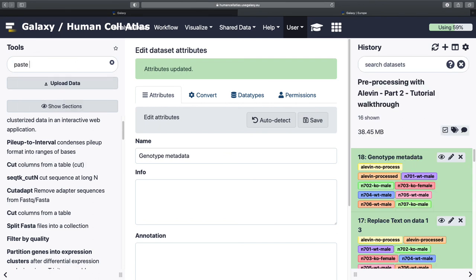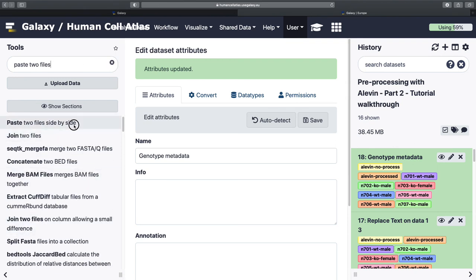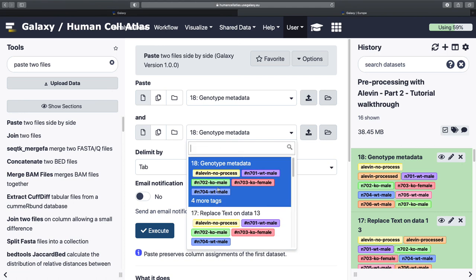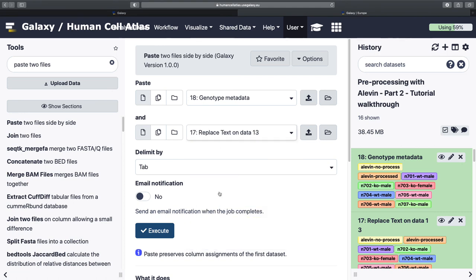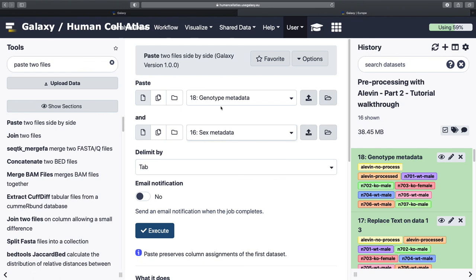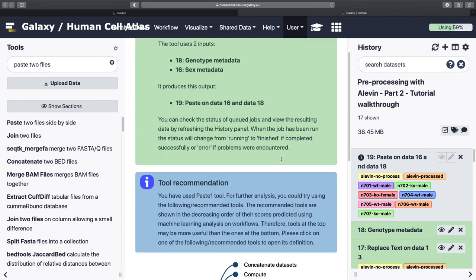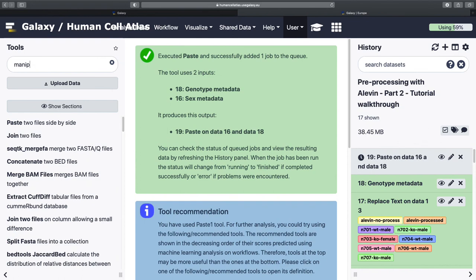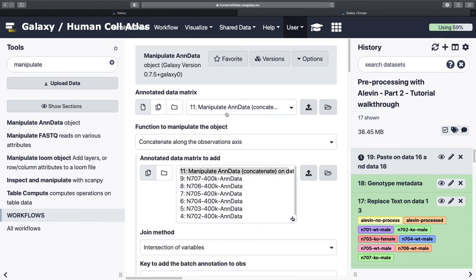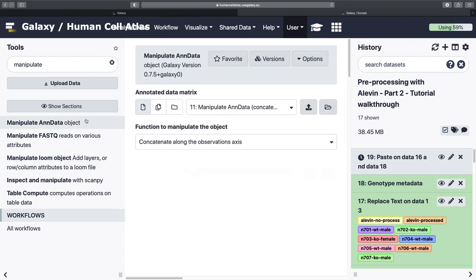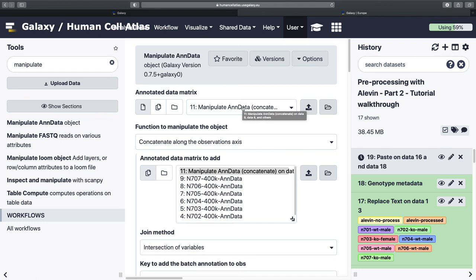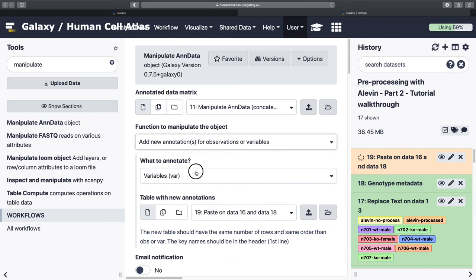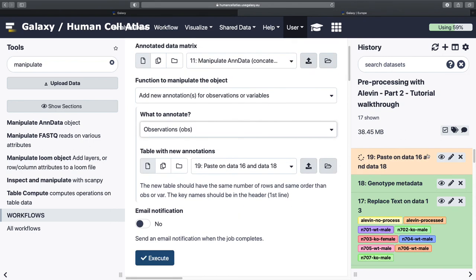And then we're going to paste two files side by side. Genotype data and sex data. Delimited by tab. Yes. I mean, you can probably skip that step and just manipulate AnnData like we're going to do in a second all at the same time. But that's how I did it the first time, so that's why I'll forever do it. In case anything goes wrong, you've at least saved yourself a little bit earlier on an easier to function step. And yeah, that looked right. And then next step, we're going to be manipulating AnnData by adding that information in.